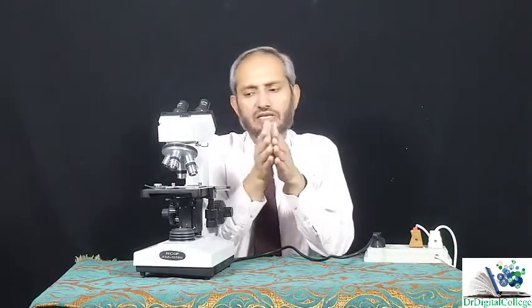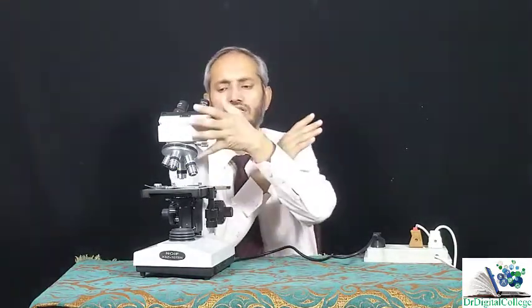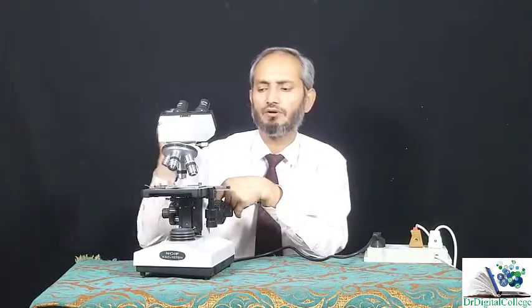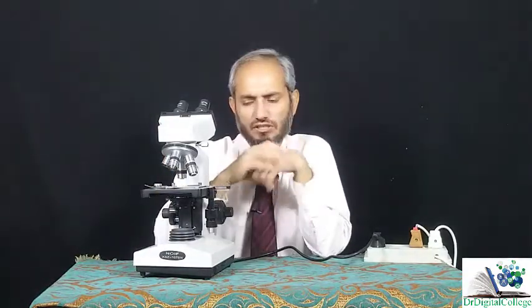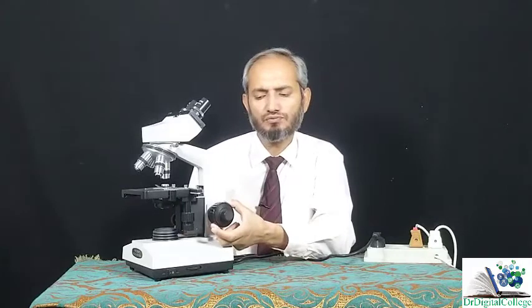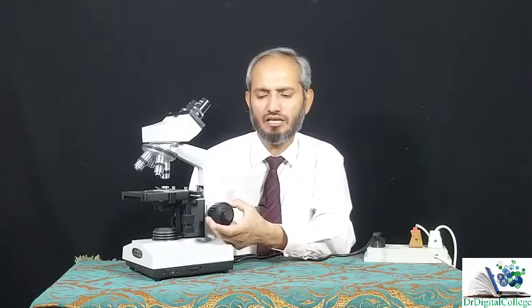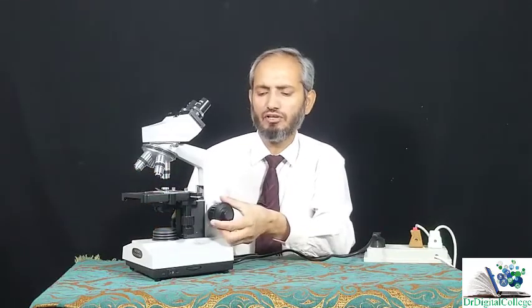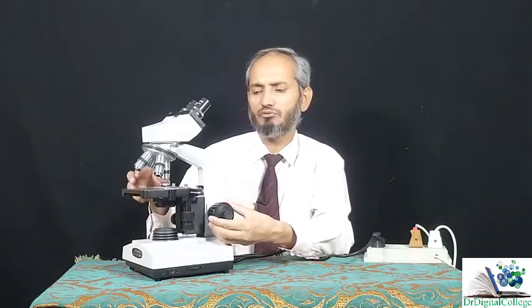But whatever it is, whether the stage is moving or this part is moving, you are changing the distance between your objective lens and the object. Okay, so that you can change the focus. Now the thing is that you can change the position of this stage in two ways. This is the major knob which is called coarse focusing. You can see I am moving it clockwise and the stage is moving down. I am moving it anti-clockwise and the stage is moving up.